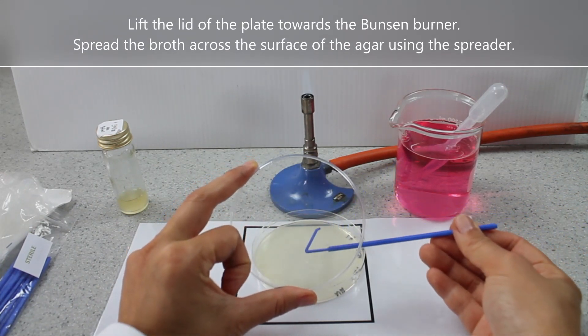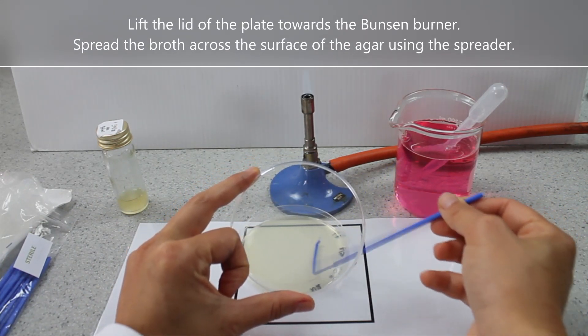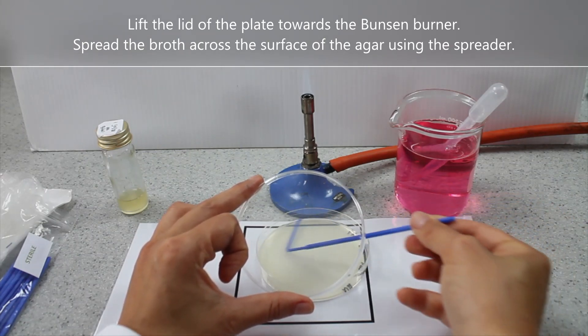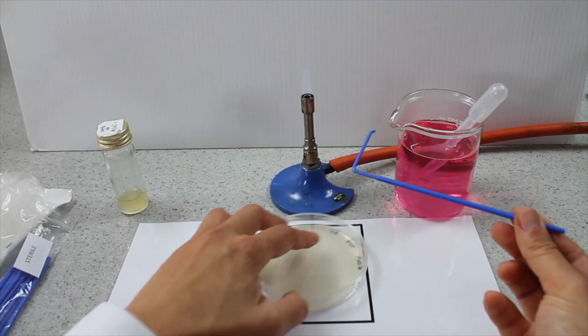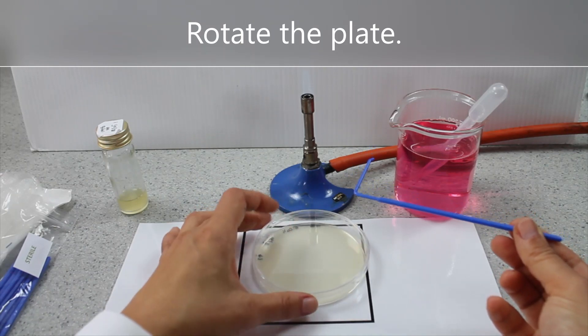Lift the lid of the plate towards the Bunsen burner. Spread the broth across the surface of the agar using the spreader. Rotate the plate.